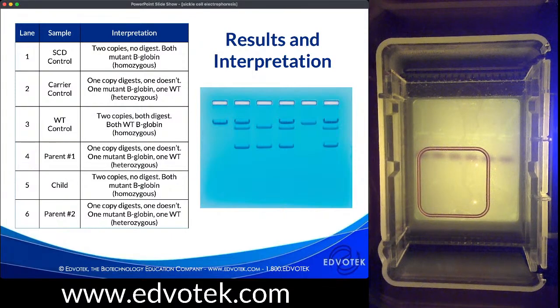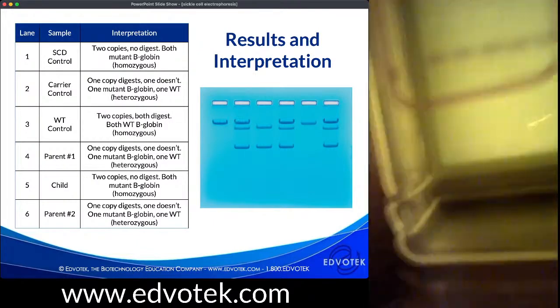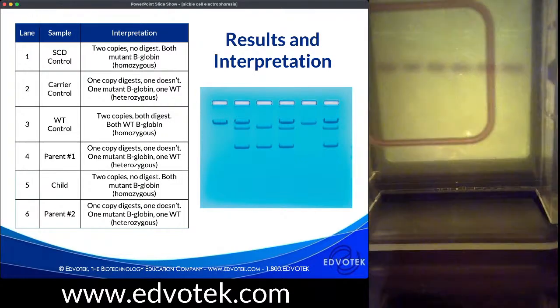You can also see them here in a Flash Blue stained gel. And what we can see is that the lanes of digested DNA in each lane created different patterns based on their sequence. So if we look at, let me see if I go a little closer, if I can really pick up those bands better. Excuse the wobble while I focus the camera.